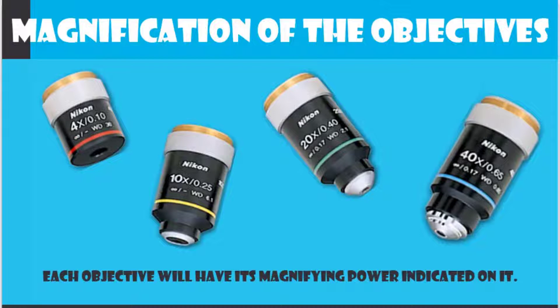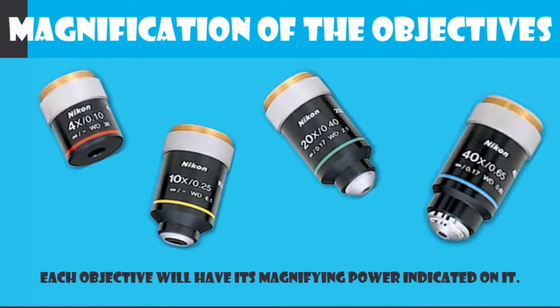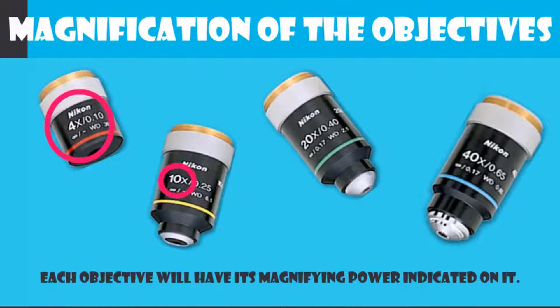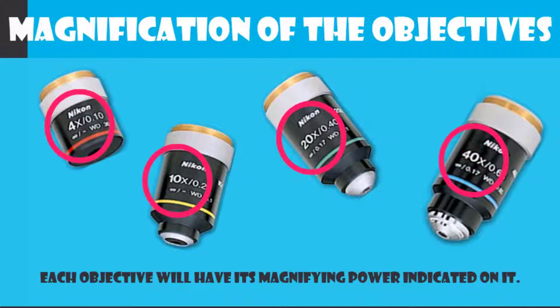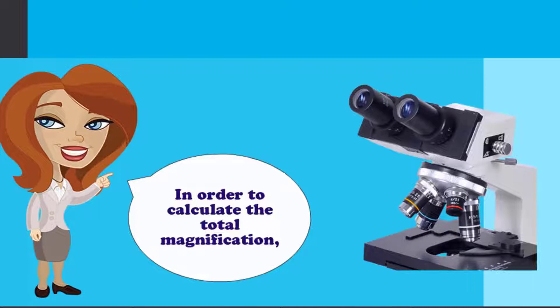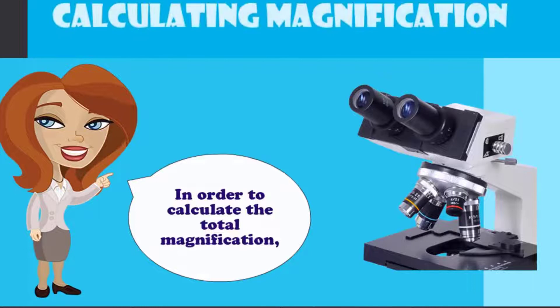To know the magnification of the objective, you will simply need to observe the magnification power that is indicated on it. For example, here is a 4x objective, a 10x, a 20x, and a 40x objective.